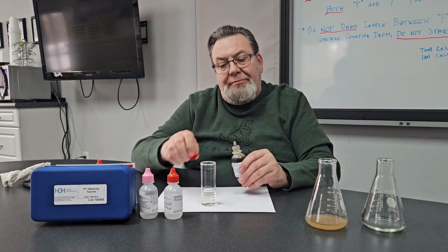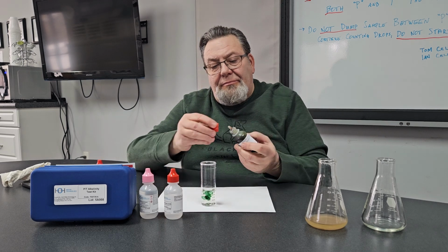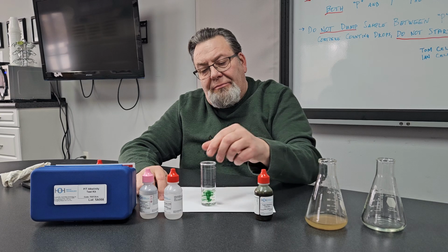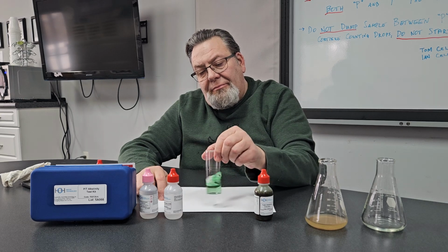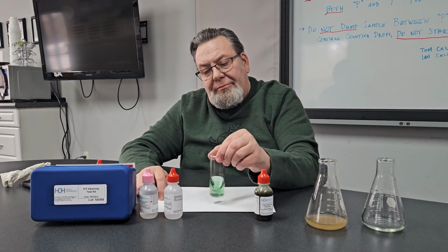Now, add 3 drops of the total alkalinity indicator solution to the sample. In samples that contain higher amount of boiler solids, you may not get a very vibrant green color. Feel free to add a few more drops to increase the color. This does not affect the outcome of the test.